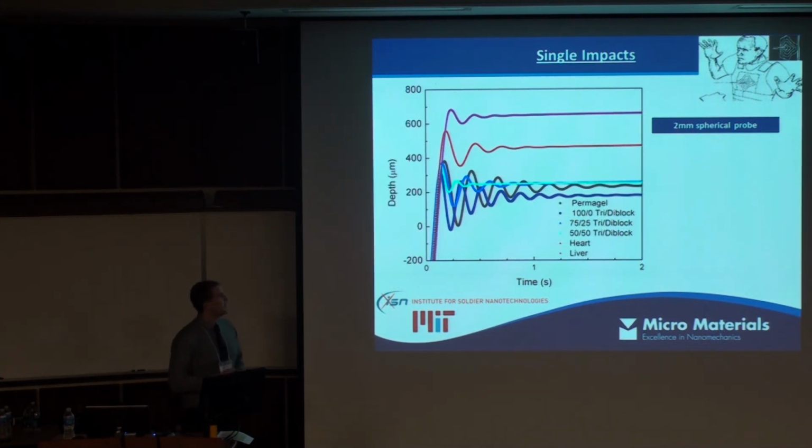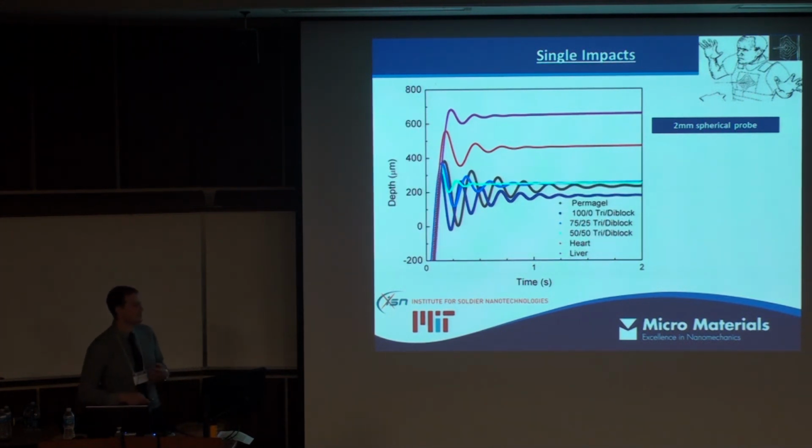So the example on the screen here is from some work done at MIT on ballistics gels for phantoms in ballistics tests. So these are used to simulate organic tissue in order to allow the development of better body armour. So it's important that the synthetic materials used replicate very closely the energy damping behaviour of these biological tissues. So what you're looking at on the trace here is the penetration depth on the vertical axis against time. So you can see this data captured over a very short period. So we have a very high data capture rate in order to allow us to get this information.